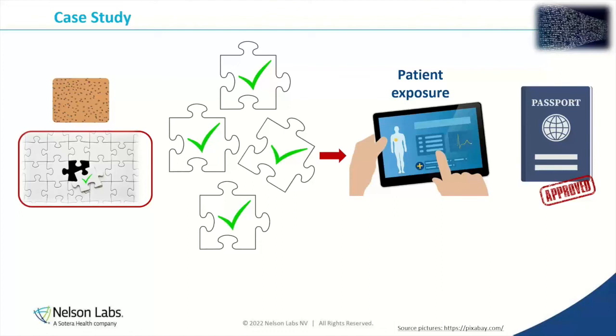In this case, the device was incredibly low risk, had a low patient contact. Even at our lowest extraction parameters, we still weren't passing for a full combined device. So we were able to just tell the story one by one about patient exposure, possibility of risk, pull in the other testing data to support, in the end, patient safety altogether.